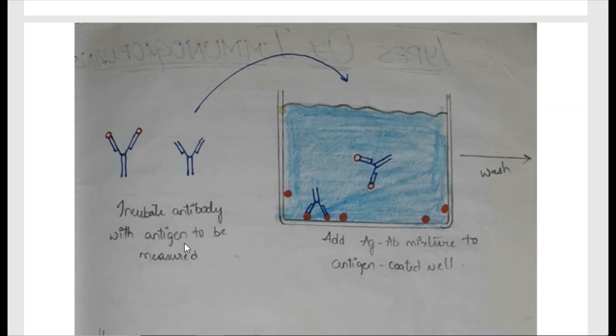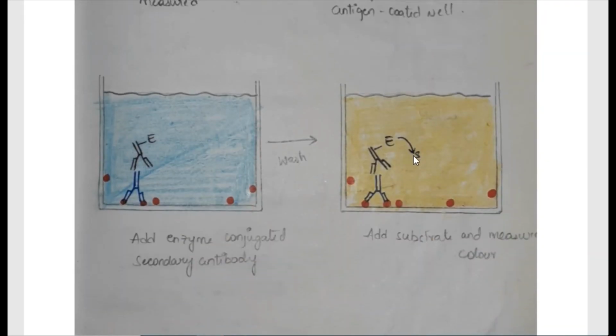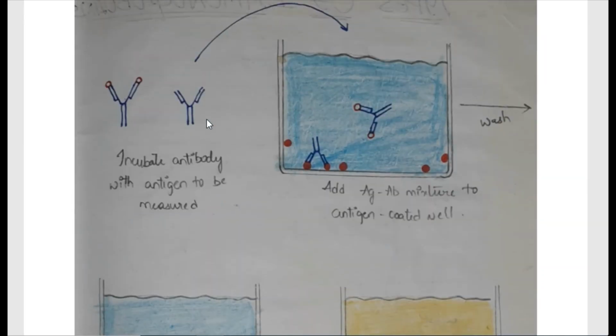So that is how the higher the concentration of antigen in the original sample, the lower will be the absorbance. Why the lower? They can't bind to this well, so we cannot get the breakage of the enzyme substrate with the help of the one which is not bound. So there is a competition between the unbound antibody and the bound antibody. That's why this was named competitive ELISA.